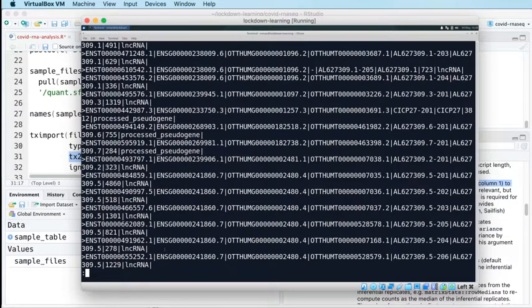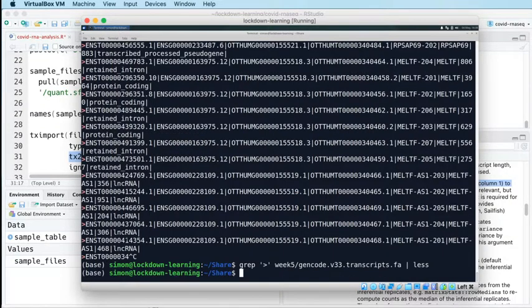Okay, so what I'm going to do is create 2 files. One file of the Ensembl transcript IDs and a second file of the Ensembl Gene IDs, and because on every sequence identifier line in this file there is one Ensembl transcript ID and one Ensembl Gene ID, what you end up with is 2 files that are exactly the same length, so the same number of lines, with the IDs in the same order.